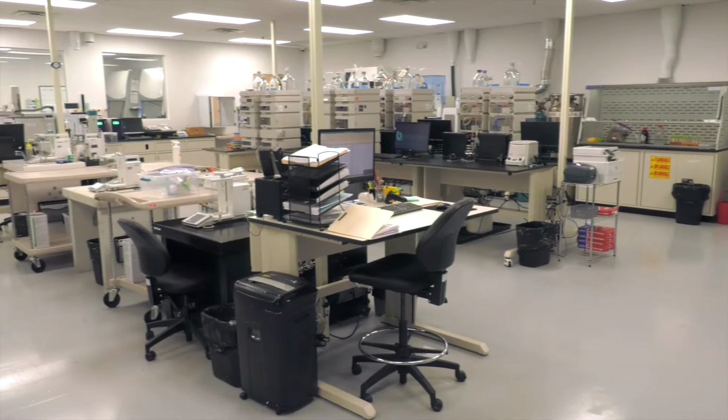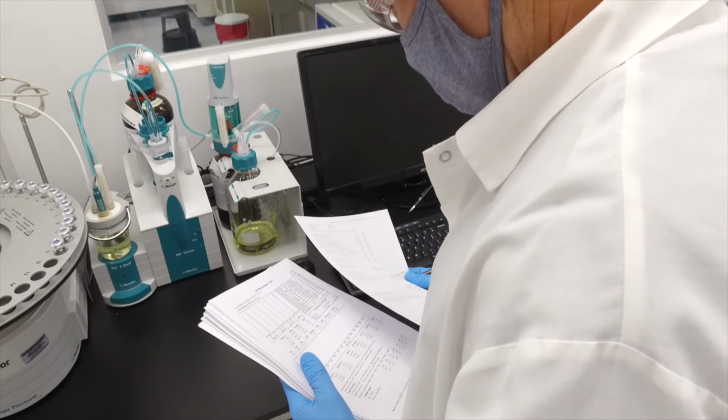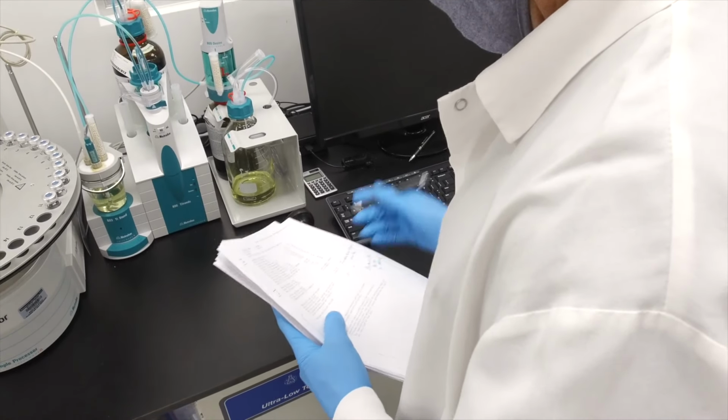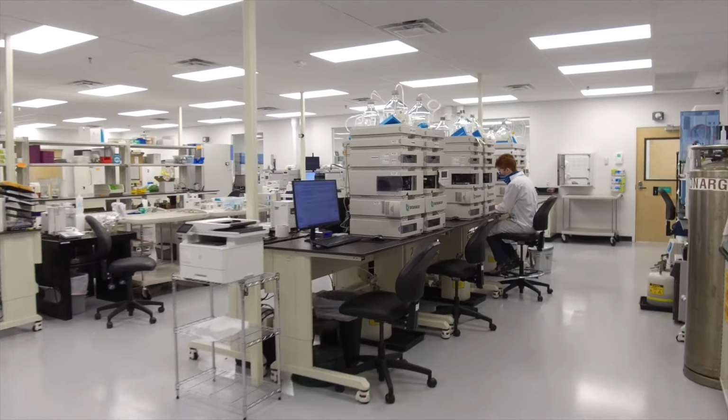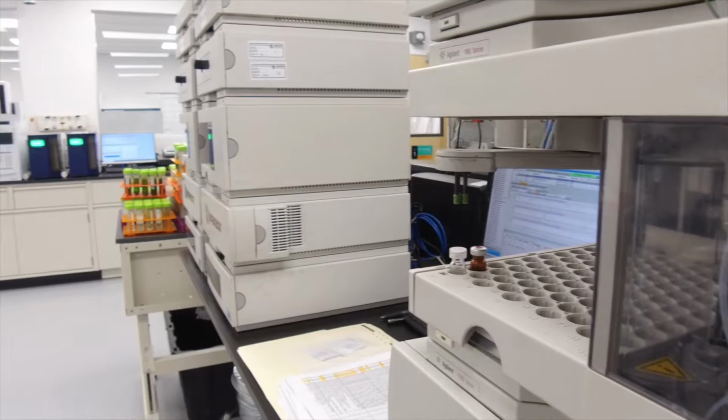If a manufacturer were to send their product to 2 different laboratories, one laboratory had all of these process controls and all of this validation in place, and another one didn't understand that and didn't have that in place, the uncertainty between those 2 laboratories would be so great that it wouldn't matter that these laboratories are using the same method. That is exactly why we validate each and every process in our laboratory, which is to minimize uncertainty. That, combined with a validated test method, reduces our error and gives us confidence in the test results that we generate.